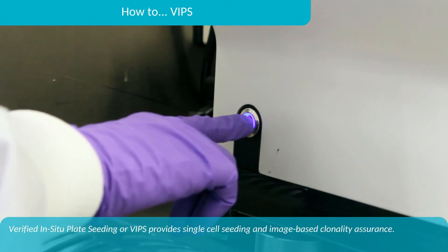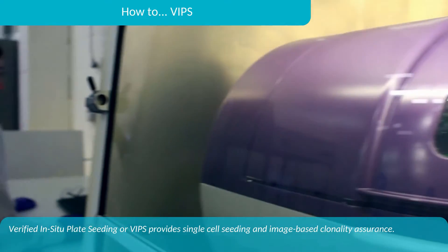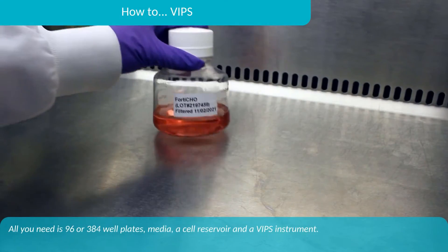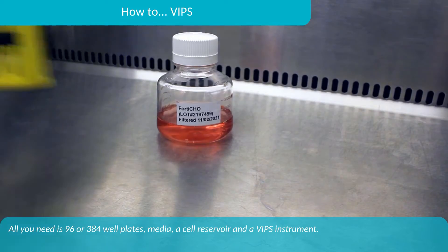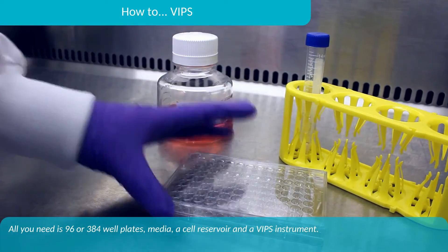Verified in-situ plate seeding, or VIPS, provides single-cell seeding and image-based clonality assurance. All you need is a 96 or 384 well plate, media, a cell reservoir, and a VIPS instrument.